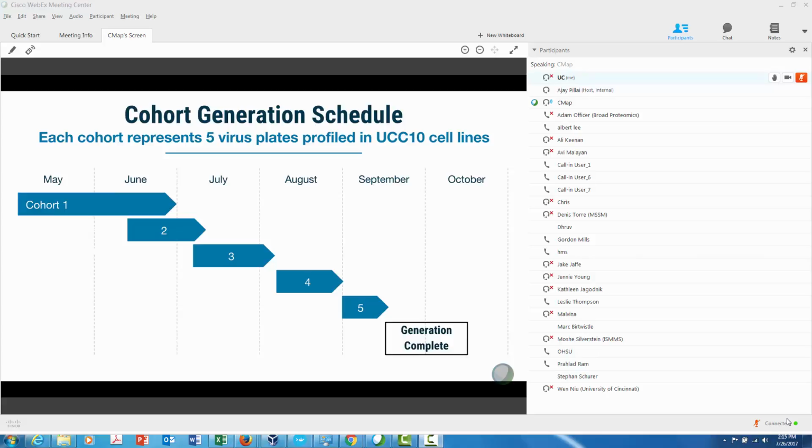Generation of a different cohort. We recently set up our own BL2+ space, so you can see that the first one took a little bit longer, and they're getting progressively faster as we automate the process and optimize aspects of it.